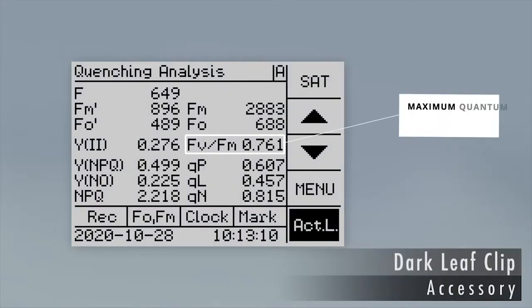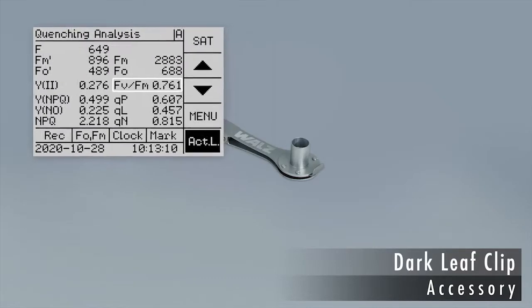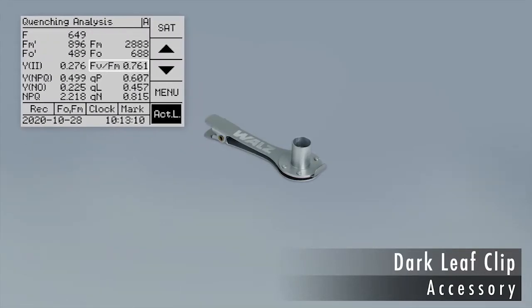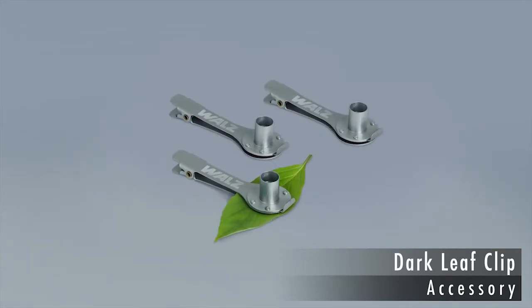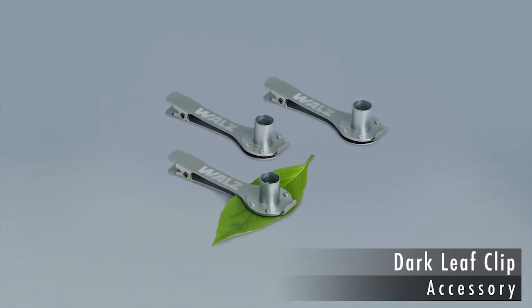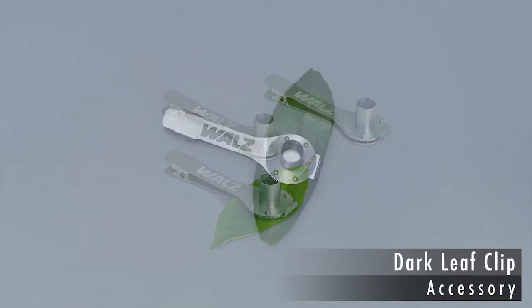The maximum quantum yield of Photosystem II, the FV over FM parameter, responds with sensitivity to many stress factors. Measuring the FV over FM requires dark acclimation. For this purpose, Waltz has developed a dark leaf clip.